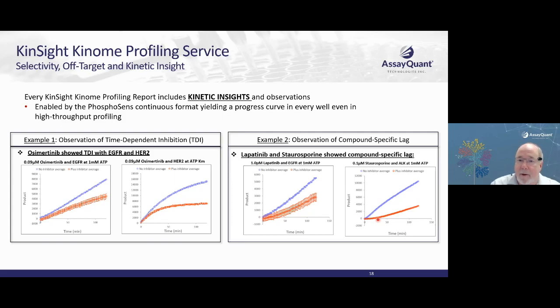They could be something that's specifically hitting compounds that are in the inactive conformation, or they are compounds that are hitting different oligomeric states of the kinase with different IC50s. We haven't had the time since we first noticed this to fully interrogate this, but it is something we'll flag for you. And if there's necessary follow-up from that, then we can definitely go on from there.